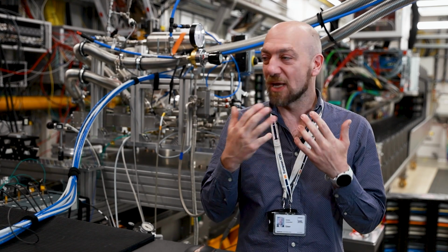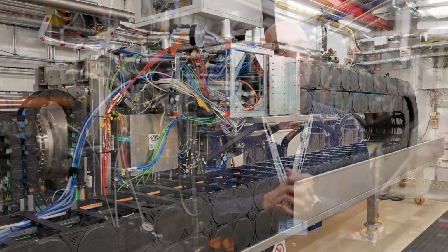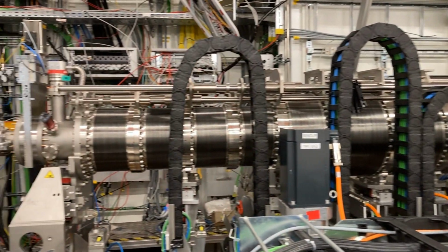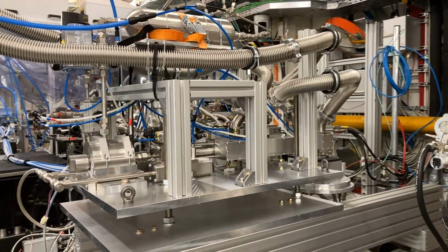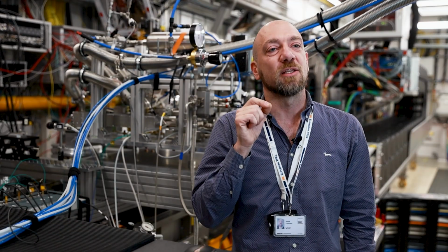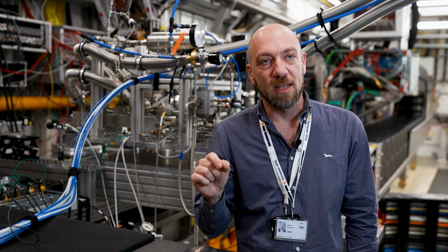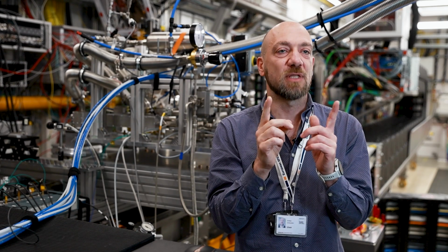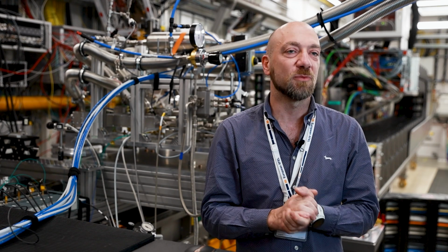Once we are able to set up this apparatus at XFEL, we can use their diagnostics at MID, in particular the small angle scattering, to monitor and probe the time history of the formation of the first nanoparticles down to 1 nanometer. And this is only thanks to the characteristics of the X-ray beam here, that we will be able to monitor these small particles in real time, with a very high resolution in time and over a large domain of time, which is the kinetic time of formation of these particles. There is no other instrument that can do this.